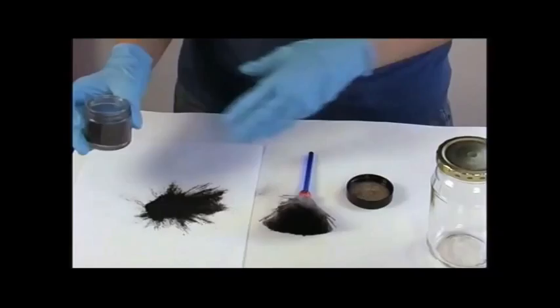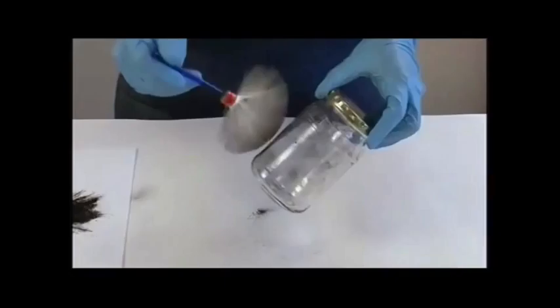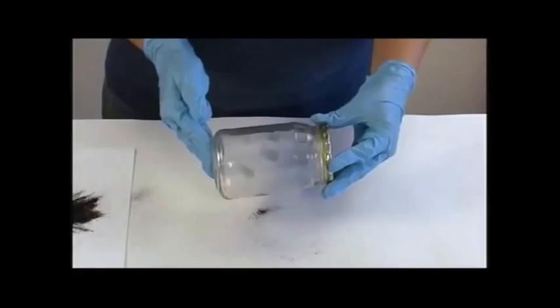You're going to spread the powder on a sheet of paper and dab the brush just a little bit. Then you're going to move in a back and forth motion on the area until you start seeing the fingerprint.